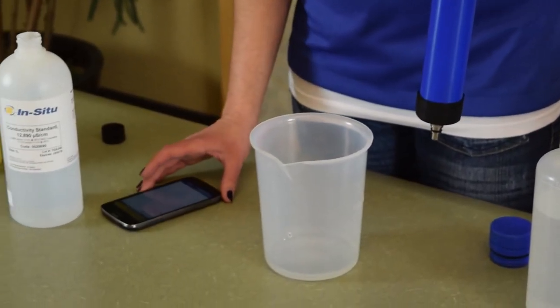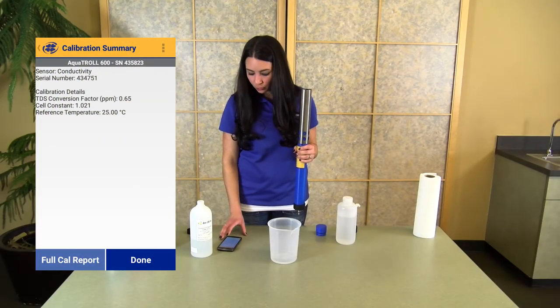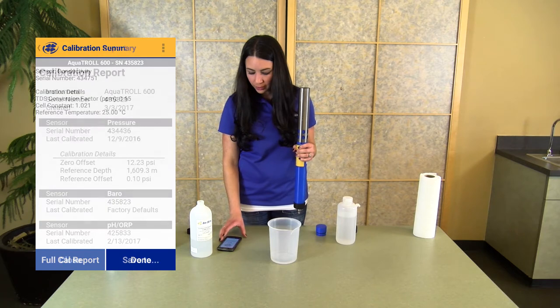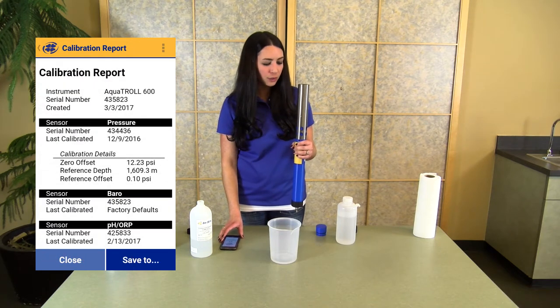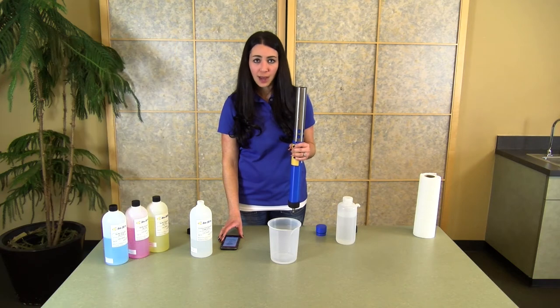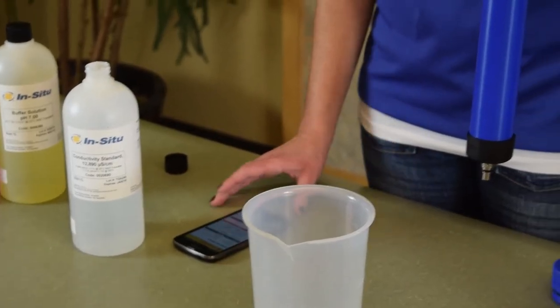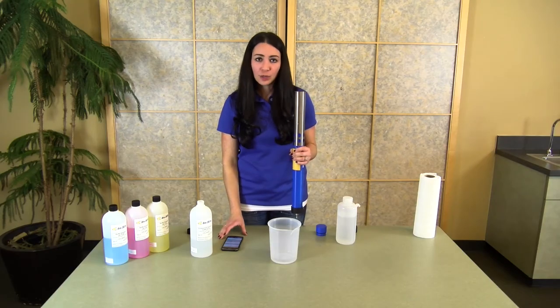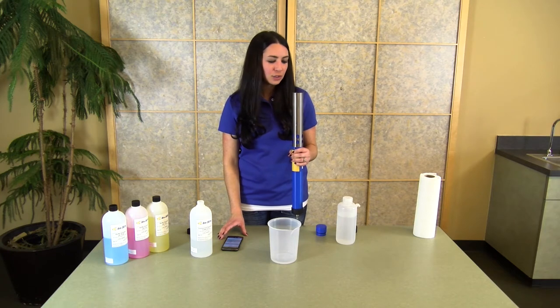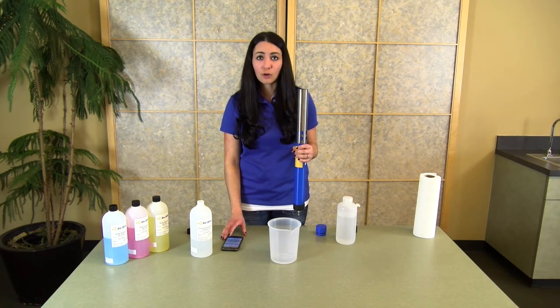Once complete, it will give you a calibration summary of the sensor. If you click Full Calibration Report, every sensor installed on your sonde will provide updated information giving you the time, the last user calibration date, as well as the calibration information for that particular sensor. The calibration report with all sensor information can be easily emailed or sent to other folders directly from the app.